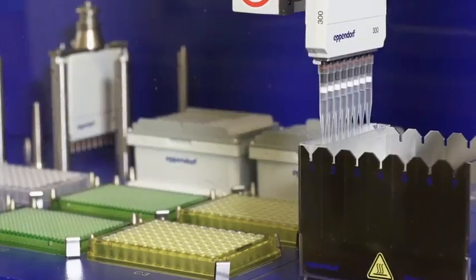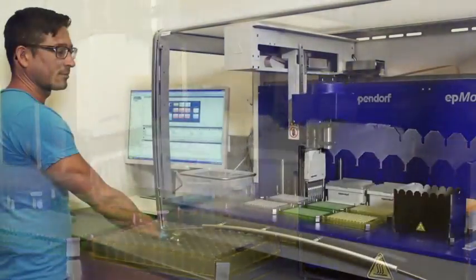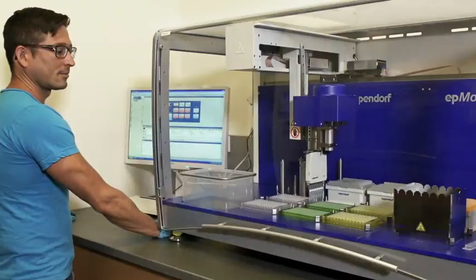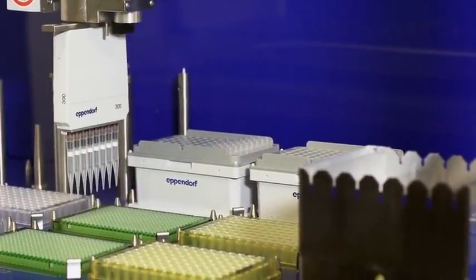Also, although DNA extraction and sequencing can be done by hand fairly easily, it can take a long time, and no one is perfectly accurate. Humans make mistakes. Therefore, in big labs like the Knight Lab, where thousands of samples are processed each month, we use robots that automate these processes, making it faster and less prone to mistakes. Don't get me wrong. People still have to get the samples ready and do some of the intermediate steps, but we use as much technology as possible to improve our results and efficiency.